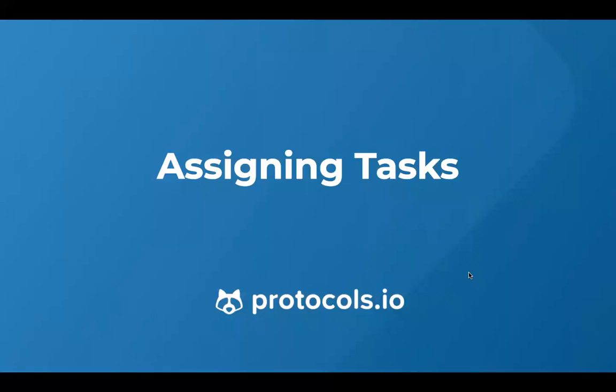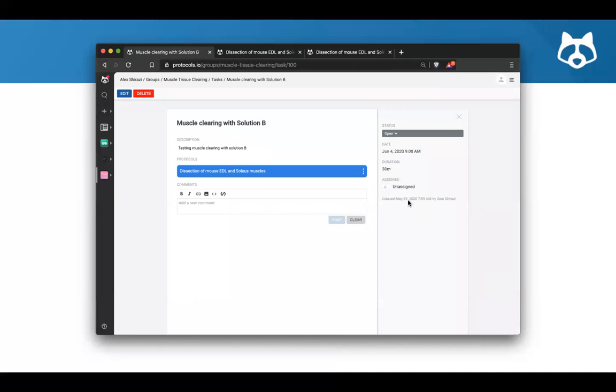So the next thing we'll be going over is assigning tasks, because you'll probably be working with different teammates in your lab, and this is something that will help you differentiate. Now, we give you flexibility to change colors of tasks or the way you've laid it out.